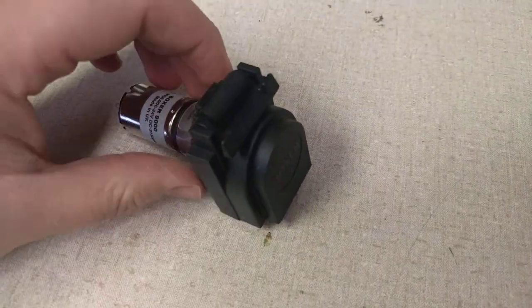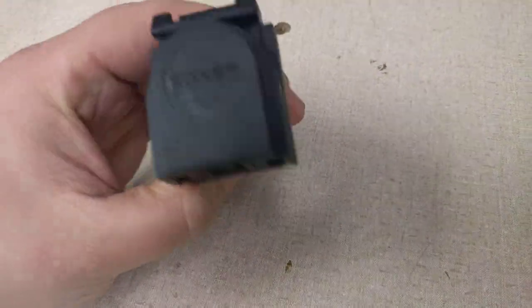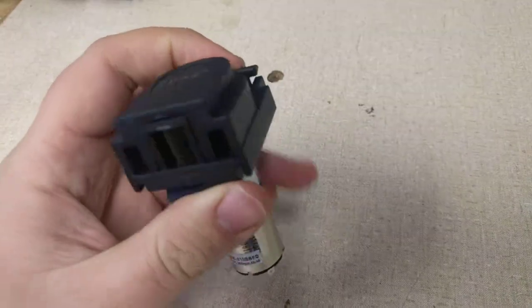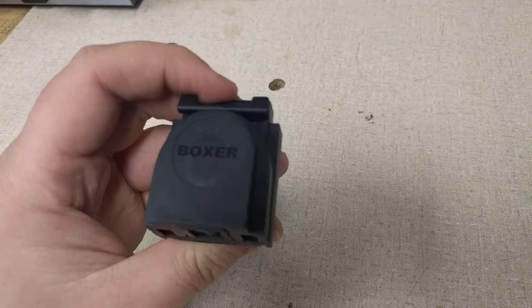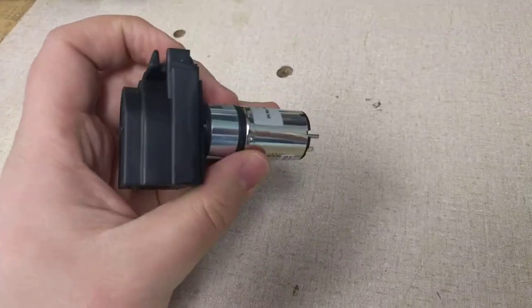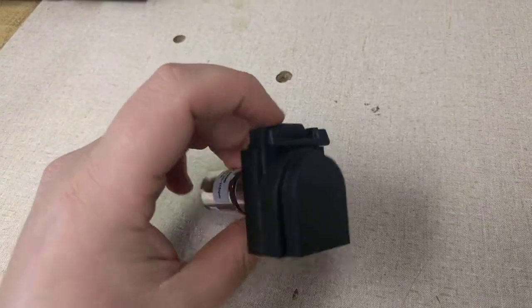Today we're looking at the Boxer 9000. This is a product that's sold by Clark Solutions in North America. Tube sizes are European tube sizes: 1mm ID, 2mm ID, and 3mm ID.